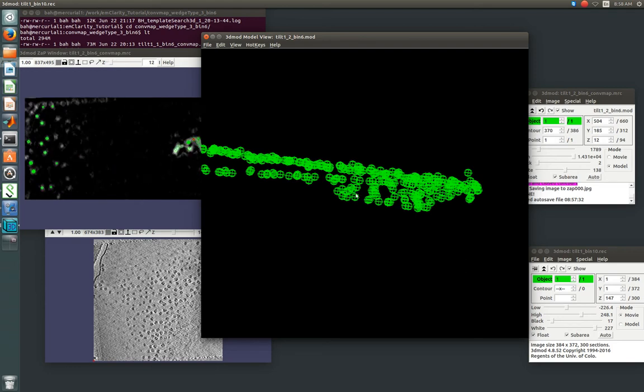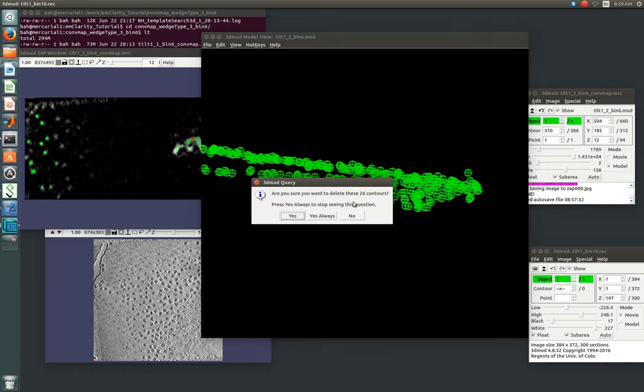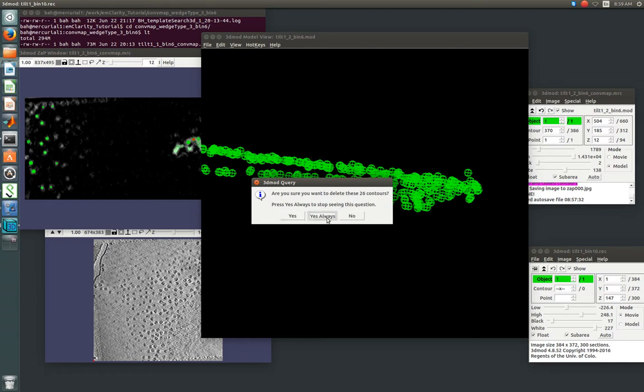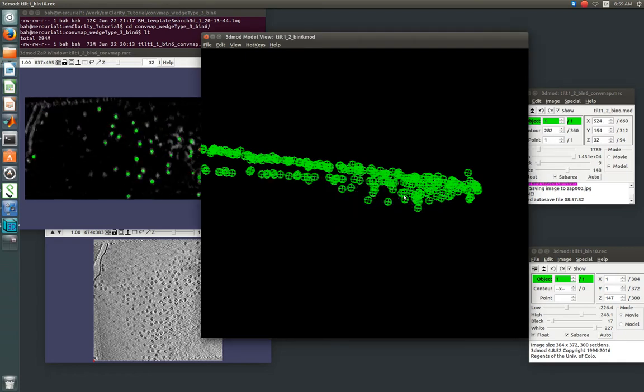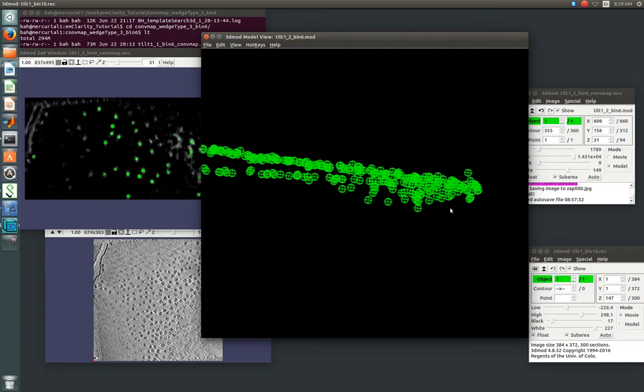So, it's kind of good to keep an eye on those and make sure you aren't inadvertently selecting points that are deeper in your field of view that you don't intend to. So, I've selected a bunch of points, and if you select more than five contours at once, Imad will ask you once, do you want to delete all these? Just say yes always. And then we're going to go through, and we're just going to get rid of everything, basically swiping over these guys.